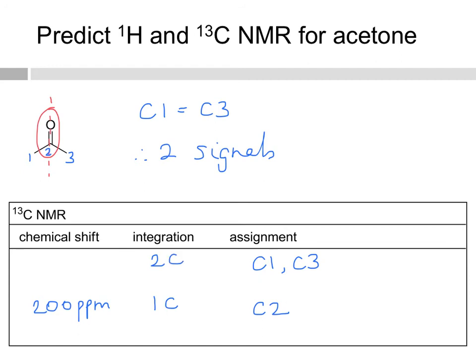The remaining 2 carbons are equivalent, and those chemical shifts are going to be between 0 and 45 because they are simple alkane carbons. And remember again, since they're attached to an electron withdrawing group, it's probably going to be closer to 45 than to 0. So here we would expect it maybe around 30 ppm. And in reality, the chemical shifts are 33.1 ppm and 206.0 ppm.